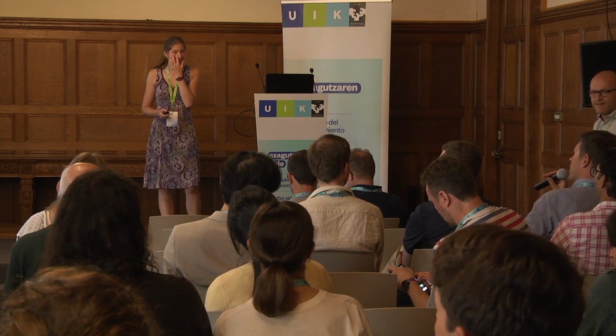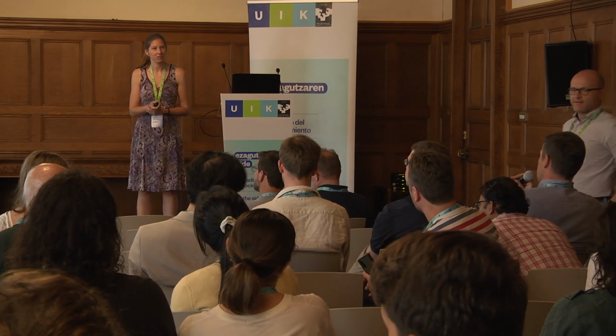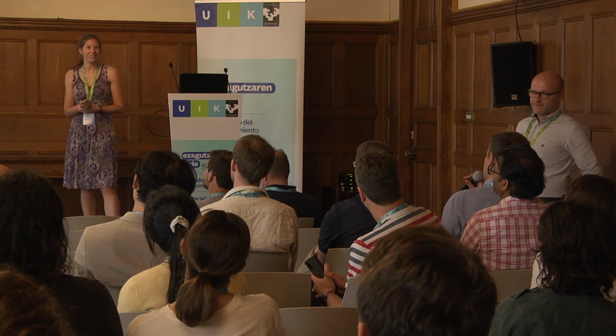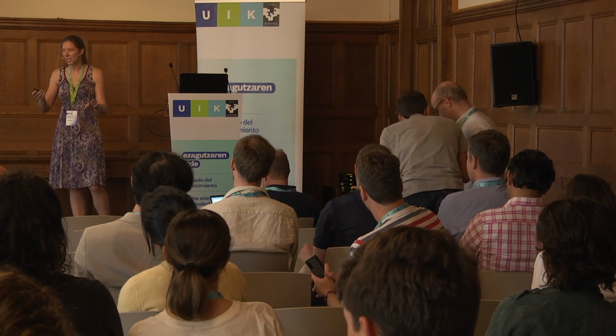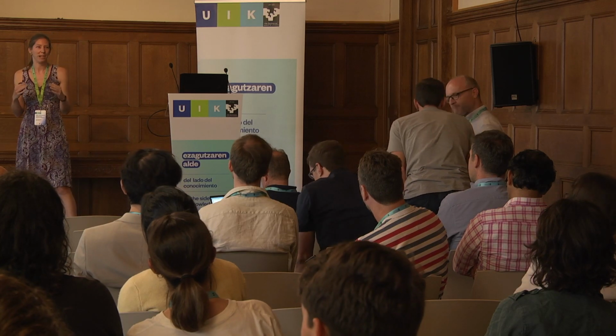Thank you for the nice talk. I have a question regarding this subtracting reference image. Don't you create other kinds of artifacts when you do this? Yeah, I mean, you have to make sure that you overlap the images. If you make the first image and then maybe you have some drift and you took another image. So what I did in order to do so, I was making some kind of correlation.